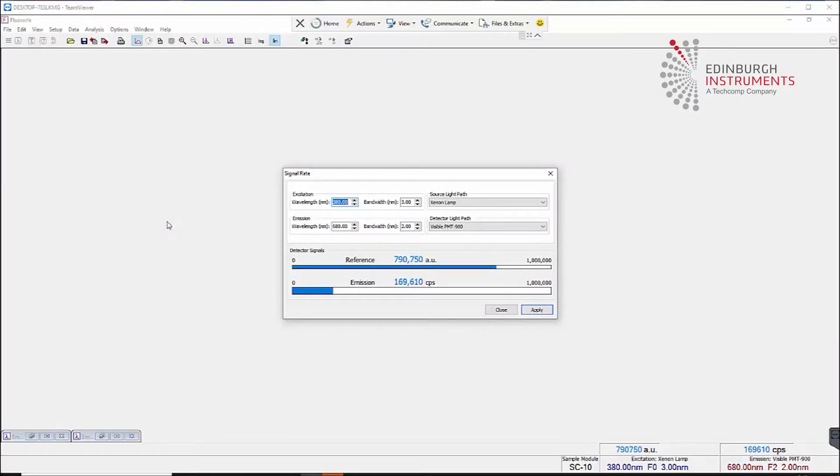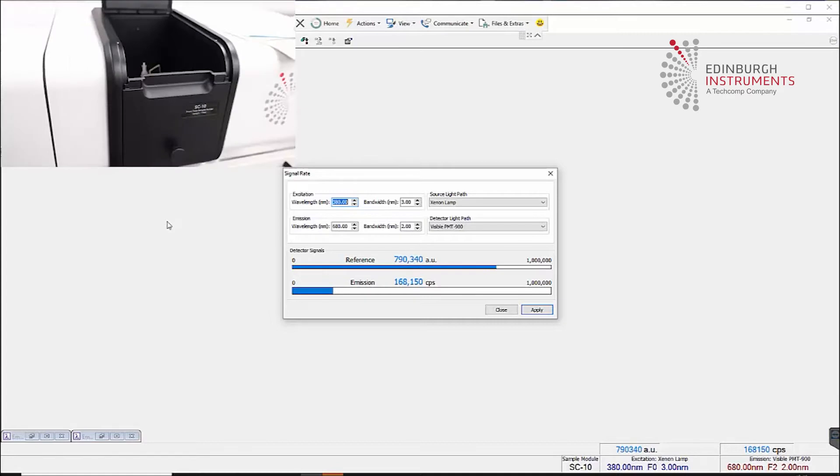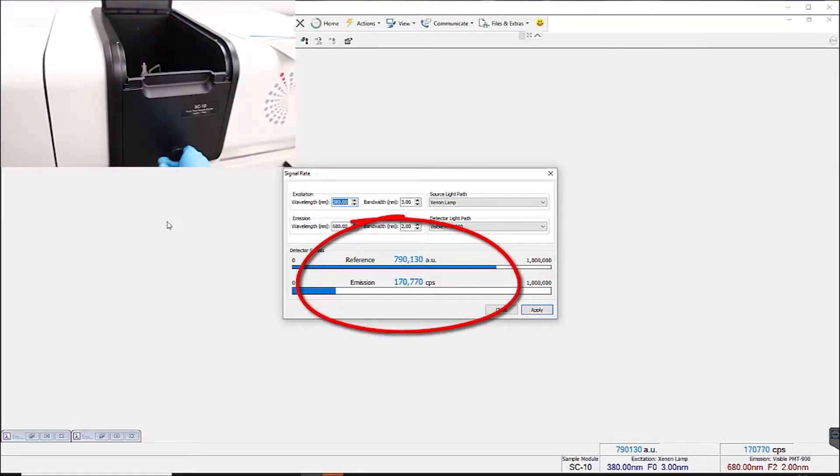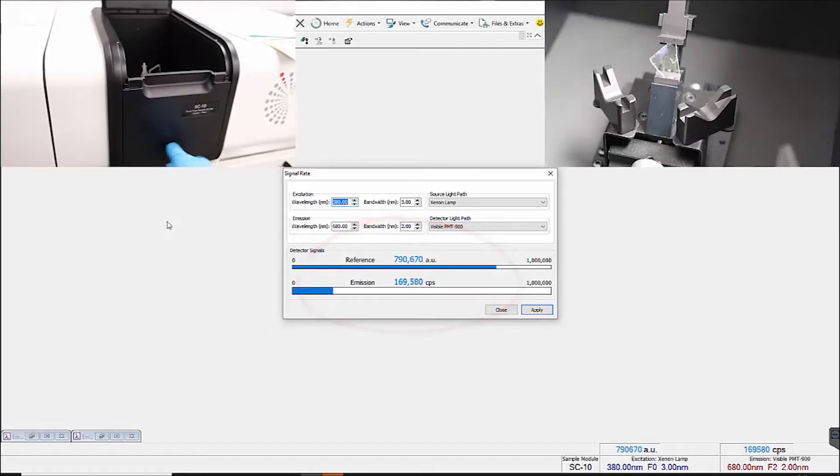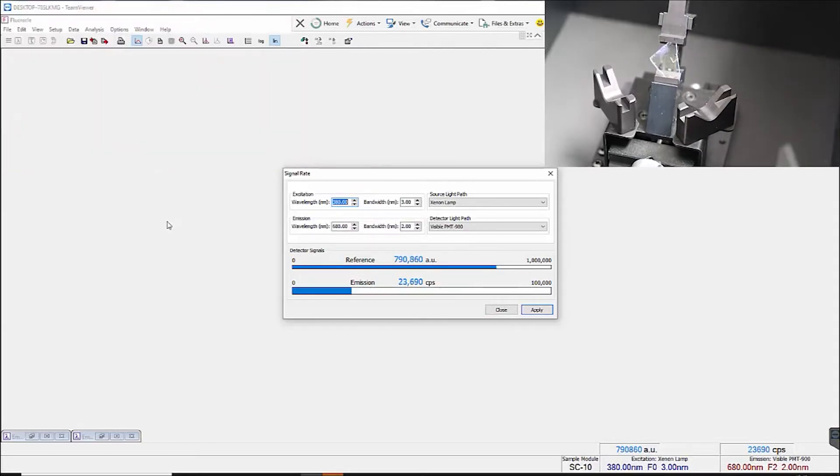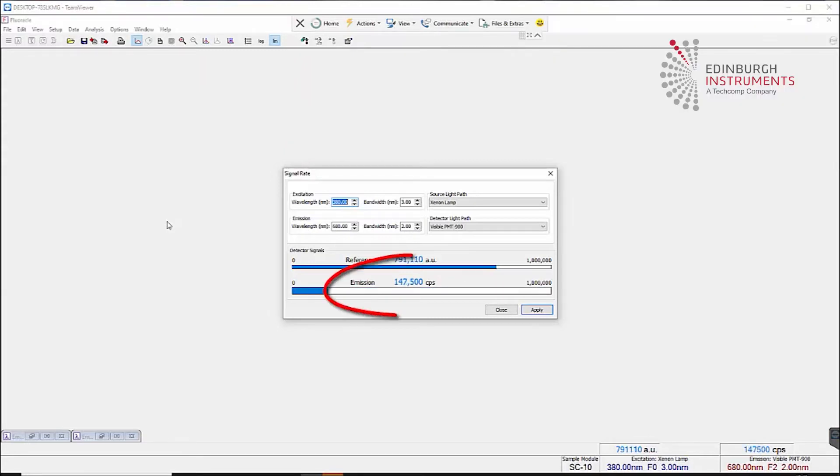After excitation and emission wavelengths are established, this information should be put into the signal rate window and the signal should be observed on EM1. After a PL signal is observed, the positioning wheel should then be moved to maximize the EM1 signal. This confirms the best alignment for the sample signal, excitation, and emission optical axis. This wheel should be moved every time a source or sample is changed to verify the best alignment.